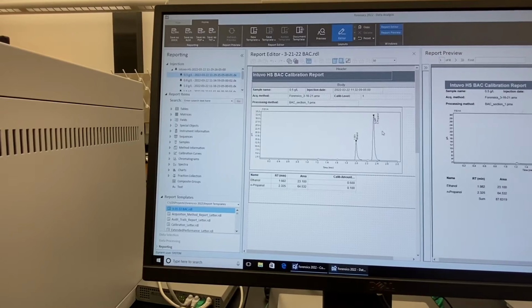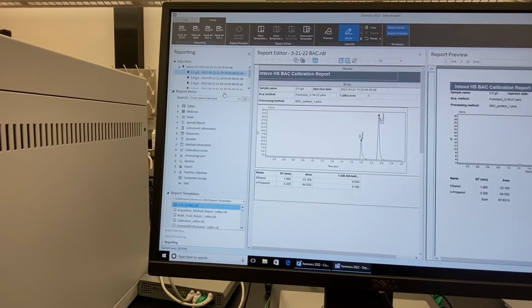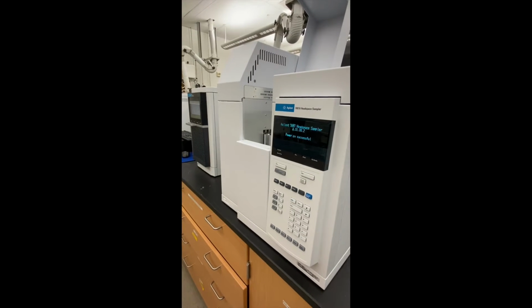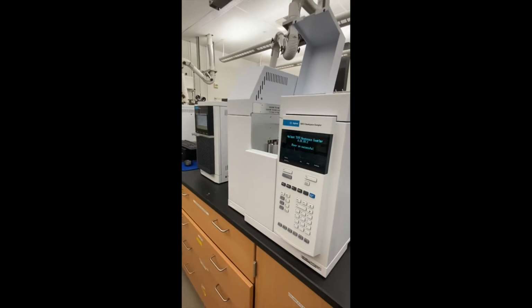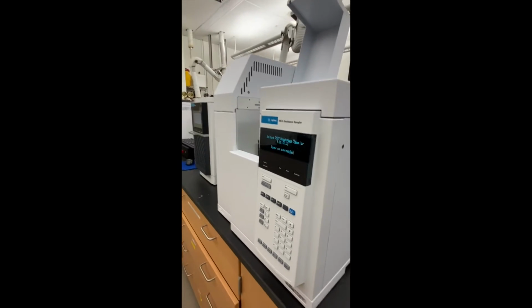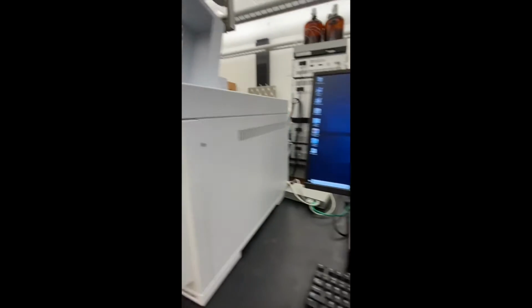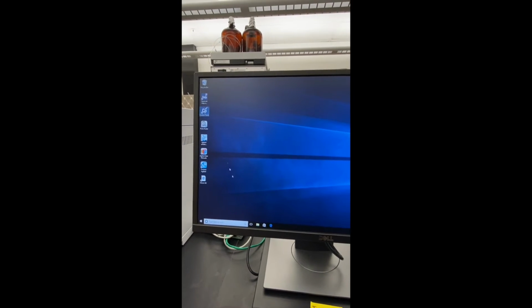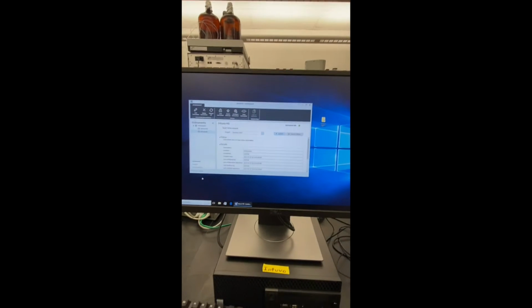And that's all you need to do for that part. And then, after you turn on your instruments and you check that the readbacks on them are good, if anything's wrong, that would be in red and stuff will be beeping, but everything seems to be good. You guys will go over here and go to control panel. So this is the program we're going to be using.